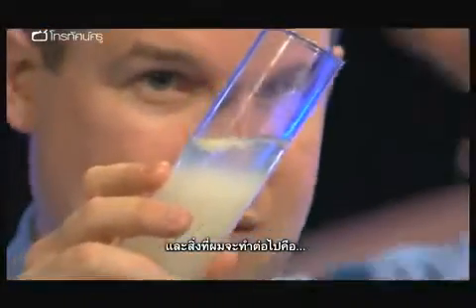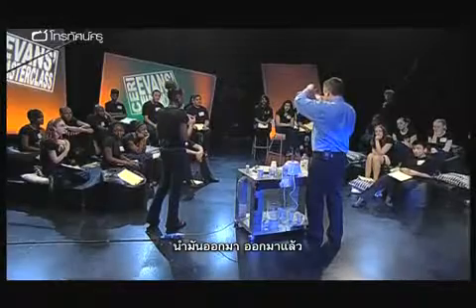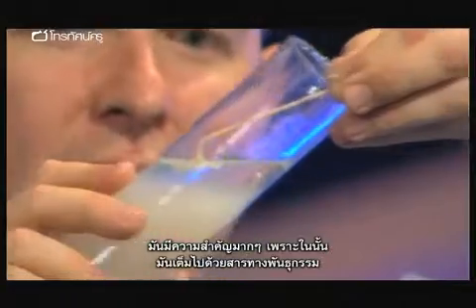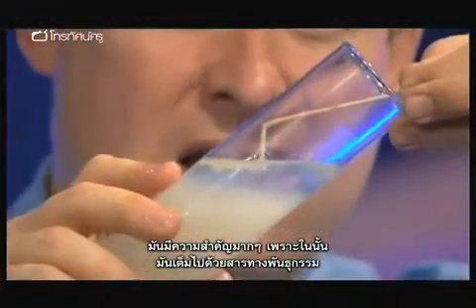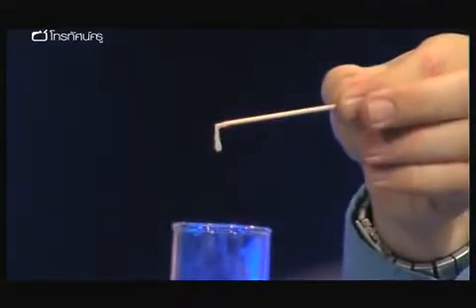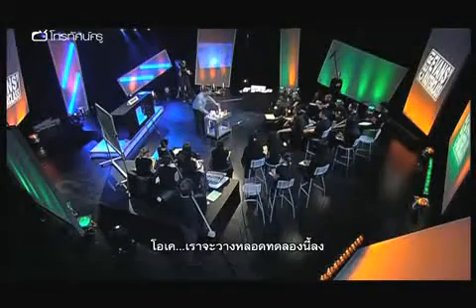So what I'm going to try to do is pull it out. Here it comes. Can you see it all pulling out? It's a bit like snot. But it's far, far more important than that, because that in there contains all your genetic information. DNA. Okay, let's put that away.